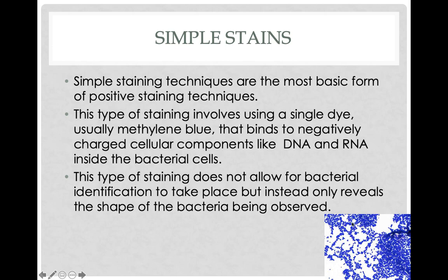So it gives you size. It also gives you shape. There are a couple of shapes of bacteria we'll talk about later. So you'll be able to look at the microscope and go, oh, this is a circle, this is a rod, this is a spiral shape. So it gives you size, it gives you shape, and it's also going to give you something called arrangement.